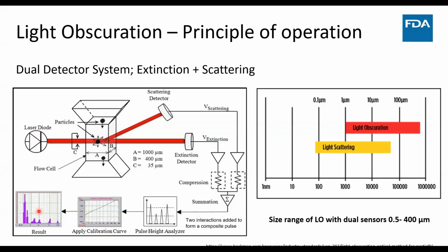So if you're looking at the things to look out for to ensure this instrument is working as it should be, the first thing you'll be looking at is how much volume is flowing through per time, because we're counting the number of particles per time or volume. So some of the things to look out for when it comes to calibration of this instrument is the instrument's ability to measure the exact volume that is going through, right? The time that is being measured, if it's a time-based sensor. These are the things you want to look out for to know whether the instrument is appropriately calibrated or not.